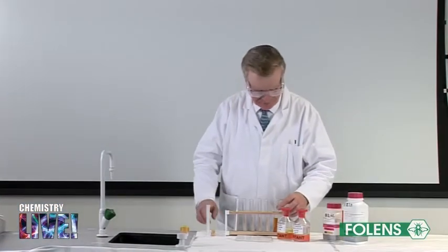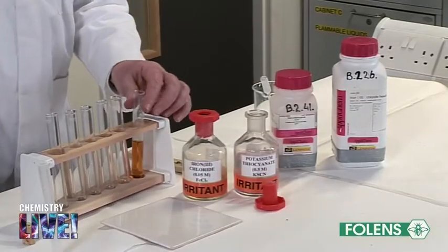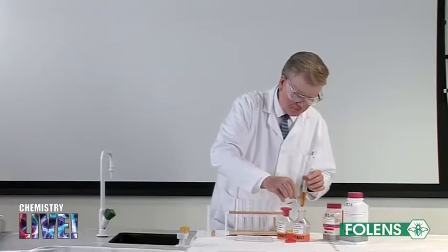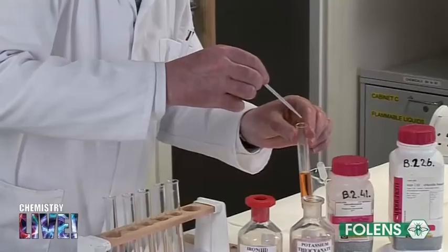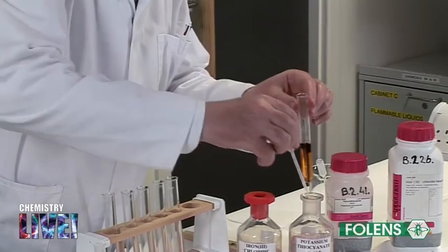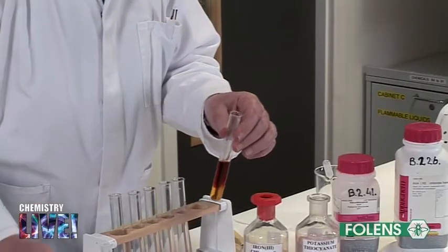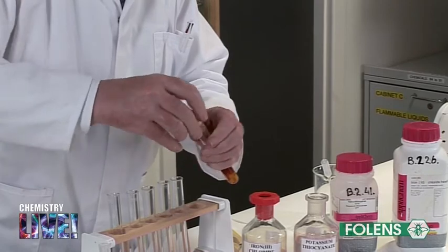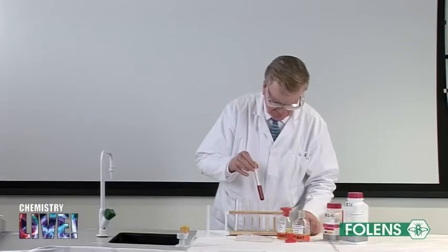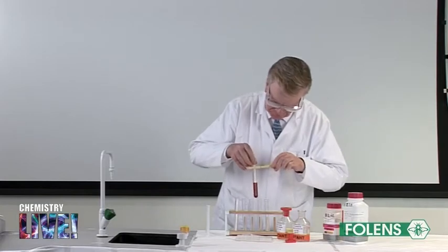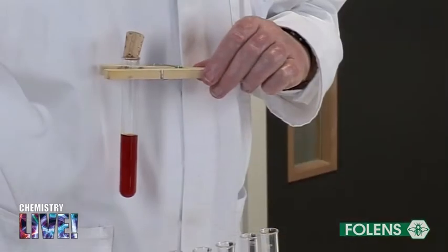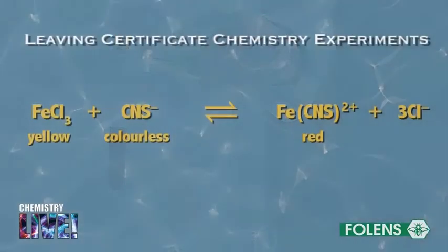Now add in some potassium thiocyanate solution. Note that a red colour is observed. In keeping with Le Chatelier's principle, the solution becomes red because the equilibrium is shifted to the right hand side of the equation shown on the screen in order to absorb the thiocyanate ions added.